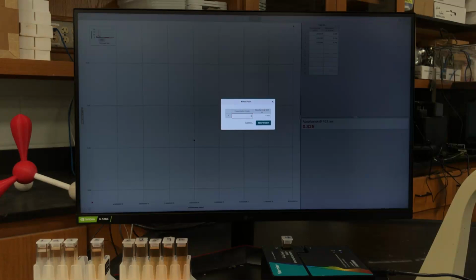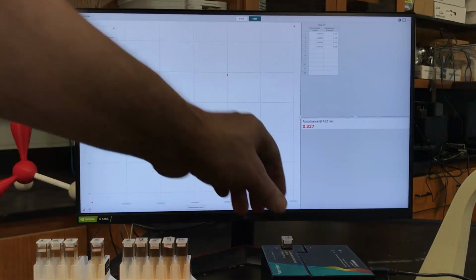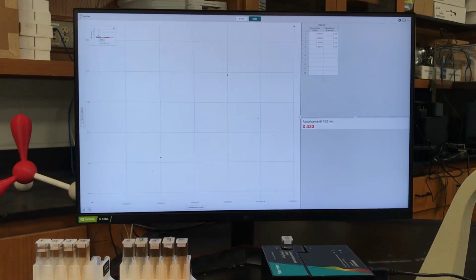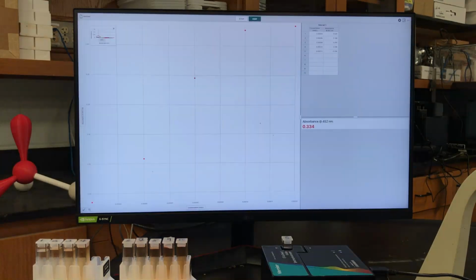This is 0.00010, okay? And then the fifth one, okay, so we're going to keep this, and this one is 0.00012. Okay. All right, so not the greatest straight line, but we're going to use those relationships to build the best line.